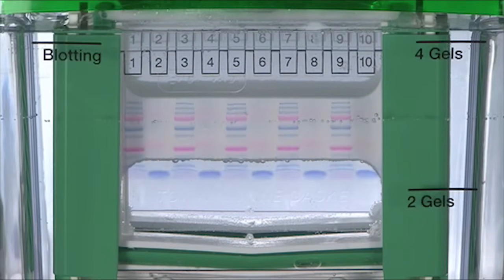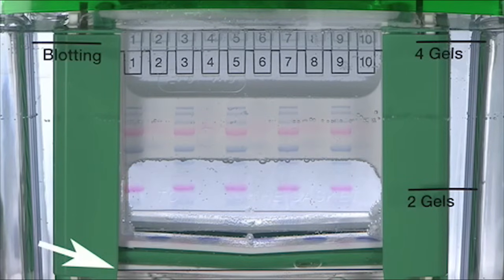The run is complete when the sample dye front reaches the reference marker on the bottom of the cassette.